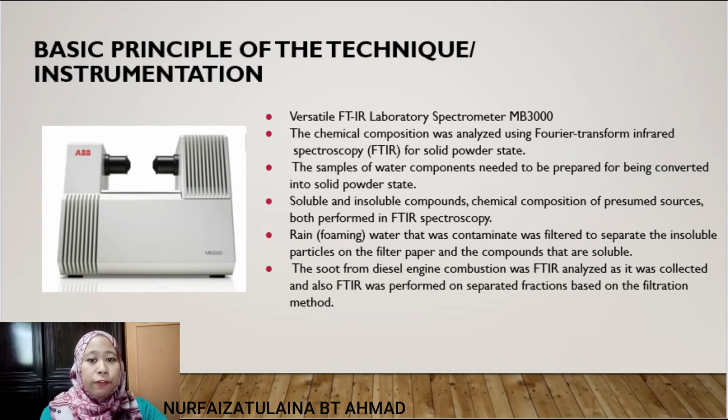So, rainwater forming sources was filtered to separate the insoluble particles on the filter paper from the compounds that are soluble, miscible with water, particles that form bonds with water such as H-bonds, and surfactants that also bind with the water through their hydrophilic region and are small enough to pass through the filter paper. This method of separating the compounds was used for FTIR spectroscopy analysis purposes.